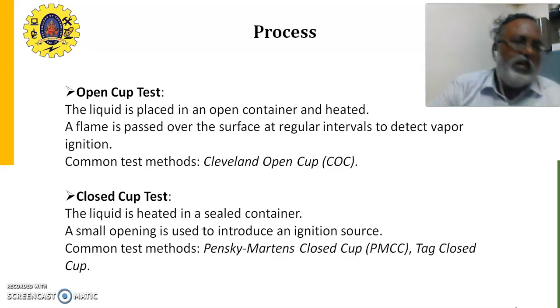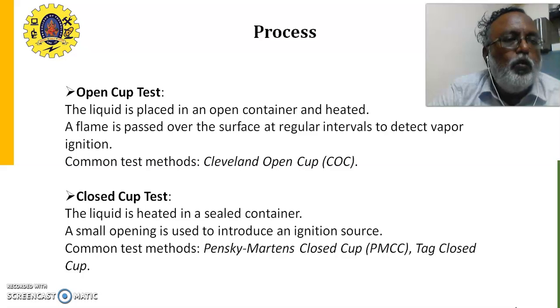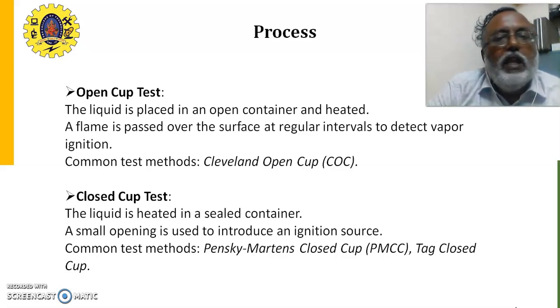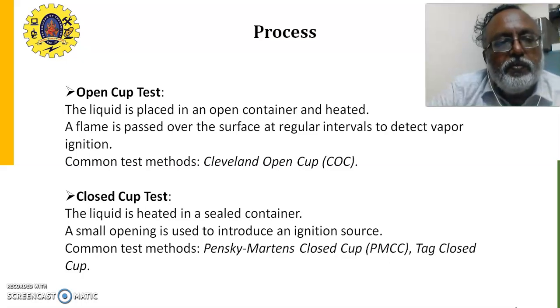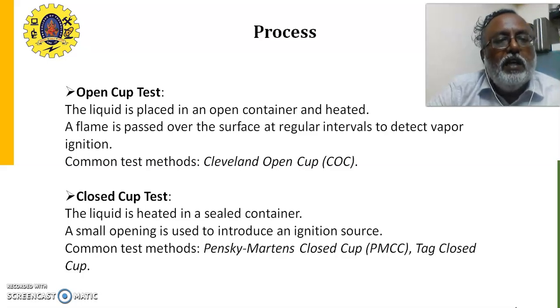Let us discuss how the process takes place. It has two types of tests. One is the open cup test, the other is the closed cup test. In the open cup test, the liquid is placed in an open container and heated.